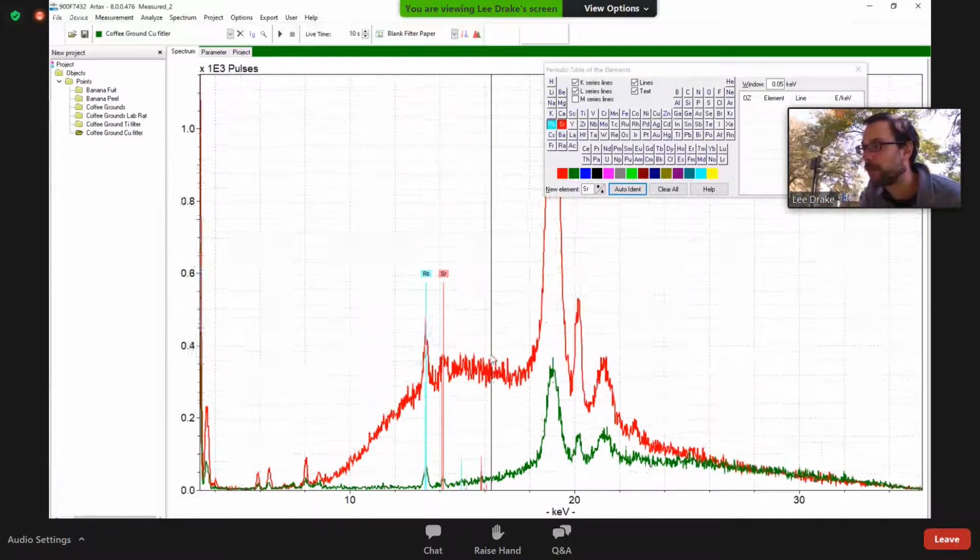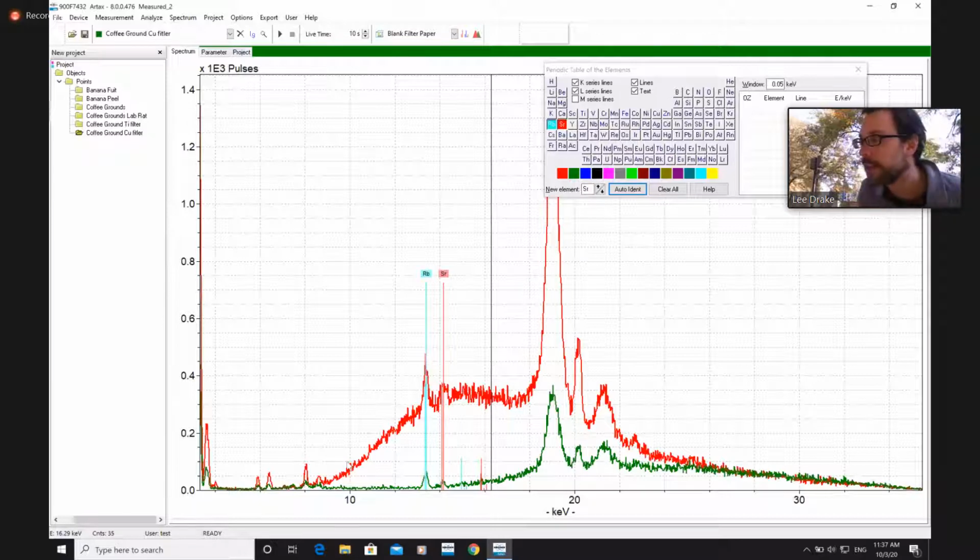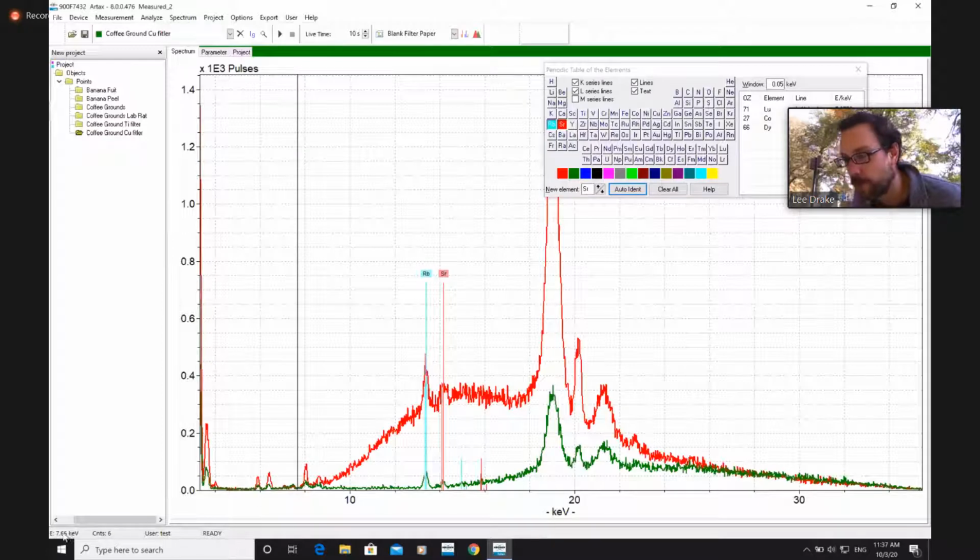So when I look at the spectrum, the red spectrum, which uses the weaker filter, you can see that the 0 point for the filter is about here at about 7.6 keV. That's when we hit 0 XRF signal. So here, the filter has blocked all of those X-rays from getting through. But what is exciting iron and manganese are all the photons to the right in this big red bubble over here. All that scatter, those photons ping the iron and manganese atoms and make their signal high, even though there's no activity right in the energy vicinity they're in. Because remember, high energy excites lower energy.